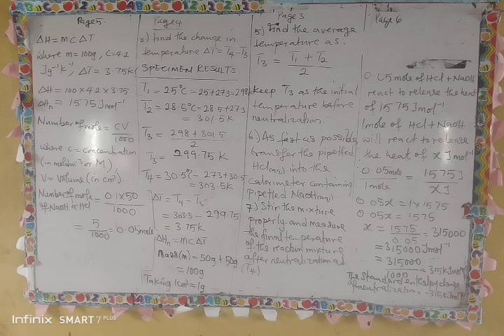How will I know that the reaction is exothermic? When you are doing it, you see that the temperature increases. The thing becomes hot. The container becomes hot. So it's exothermic. So you have to put the minus by yourself.